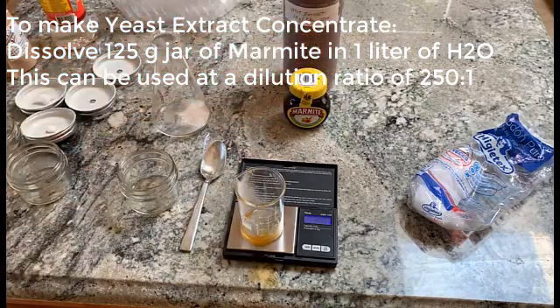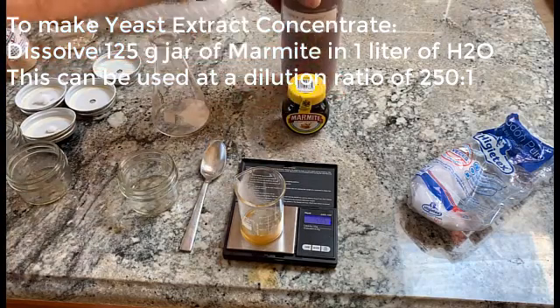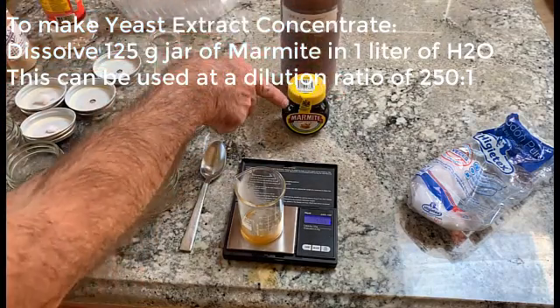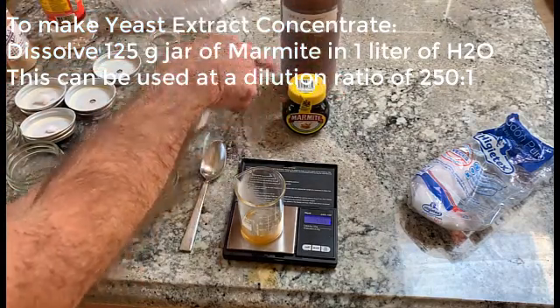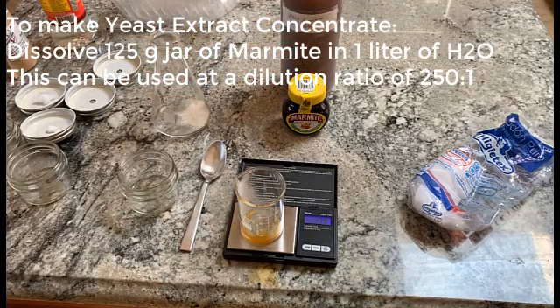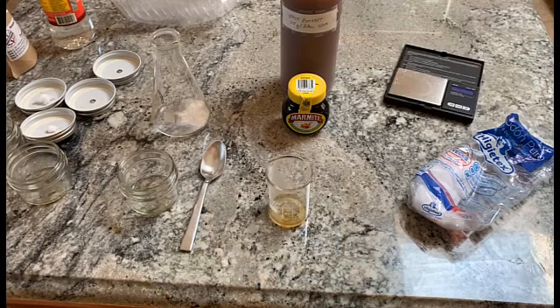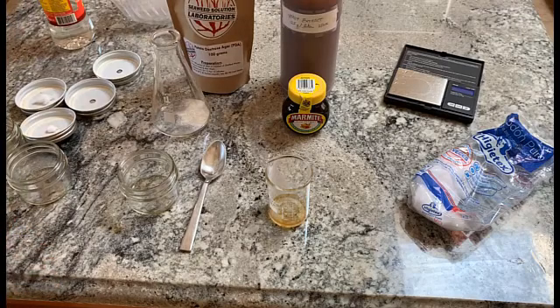The yeast extract I simply made from this stuff, which works fine — I've had this for years and it never seems to go bad. I first dissolve this in a liter of water, then use it at a strength of 250X — in other words, dilute one part to 250 parts of water. You don't have to add these supplements at all; mushroom mycelium will grow fine on regular potato dextrose agar.